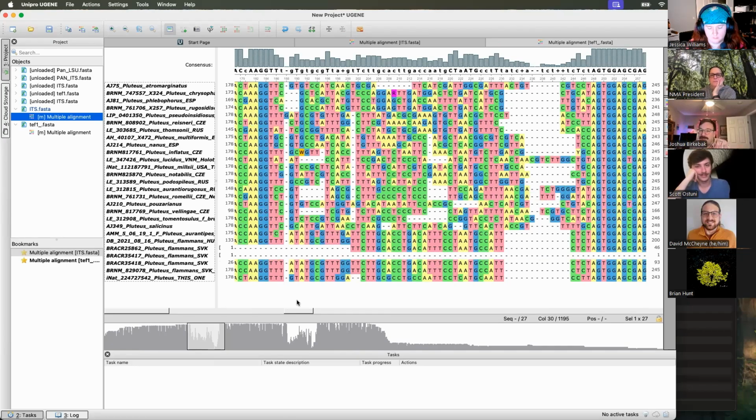There's some structure to them, and there are some requirements of what makes an intron, but in some ways there's a lot of free evolution that's not constrained by anything. So what we're going to want to find is our GT for the start of our intron position here, and it's going to end with an AG.